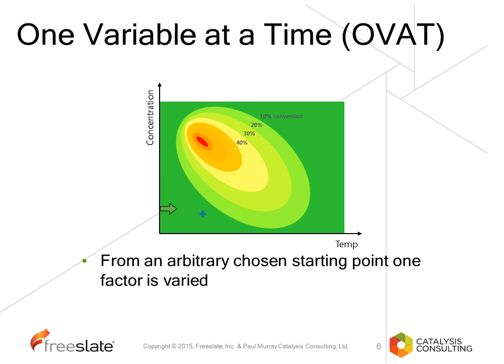And so we run another experiment at a higher temperature. And so we get another result and we see an increase in yield. And we continue to run experiments at progressively higher temperatures until the reaction starts to fall off. So we've changed one variable one step at a time. On the basis of this, we find the best reaction that we have from changing temperature, and we change another parameter. In this case, we would change concentration.